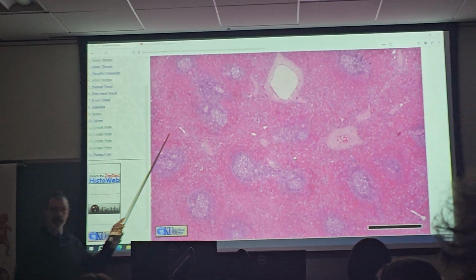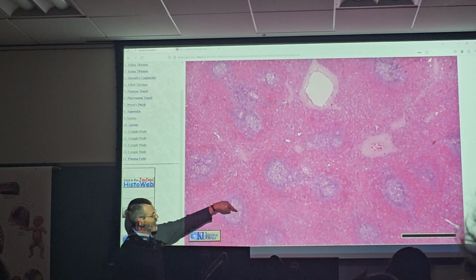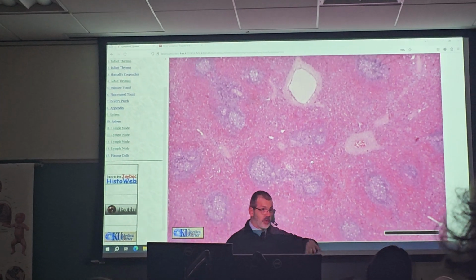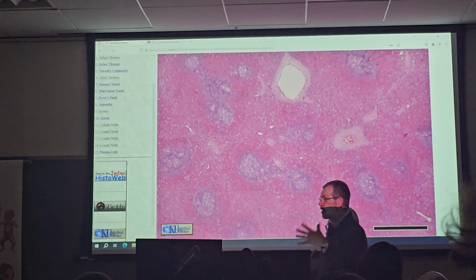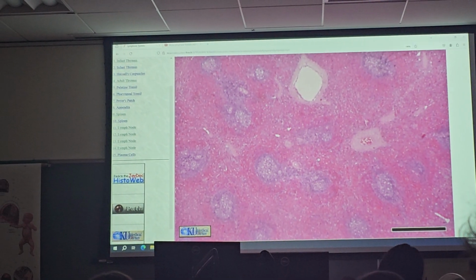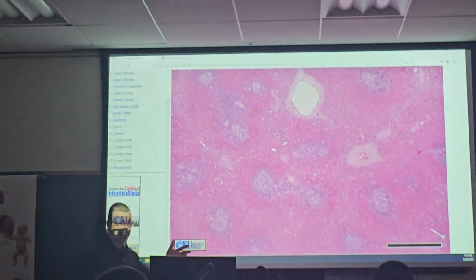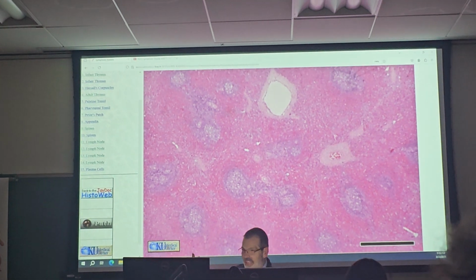Okay, everywhere, right? We call it splattered. Spleens are splattered. The dark is randomly thrown around. There's no ring, there's no room. It's just hither and yon. I see dark things kind of randomly spread all over the place, not in rooms or layers. That is a spleen. A spleen is splattered. Make sense? If you see that distinction, you'll get it.